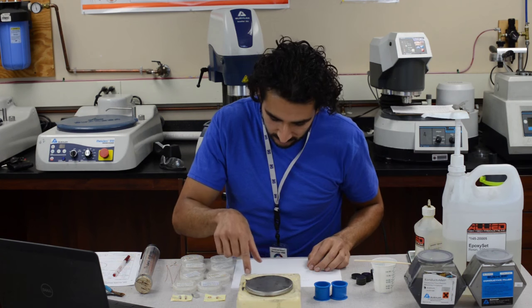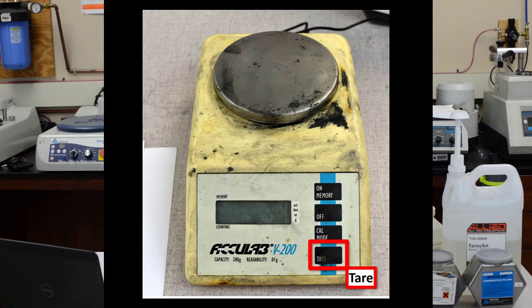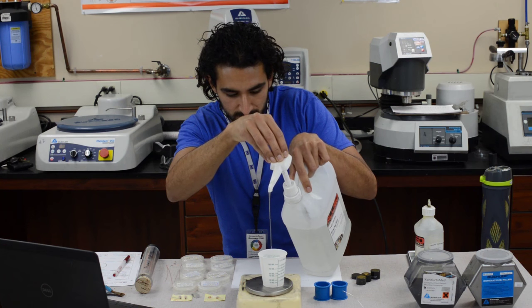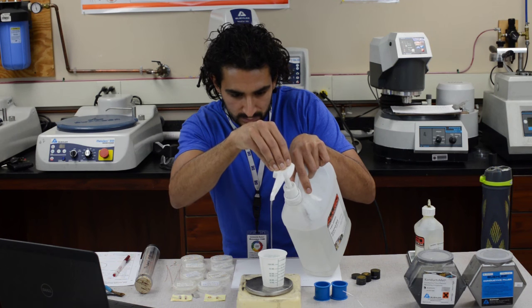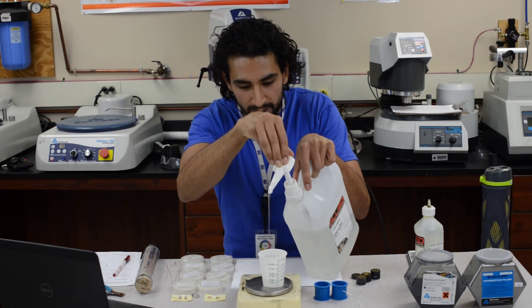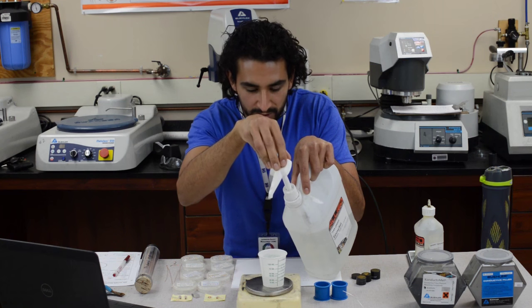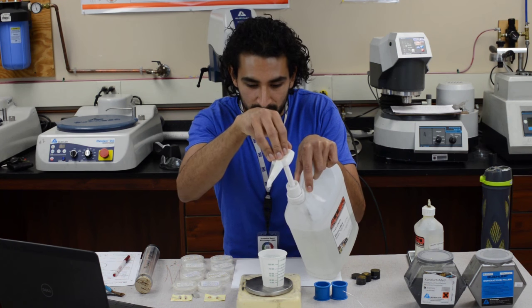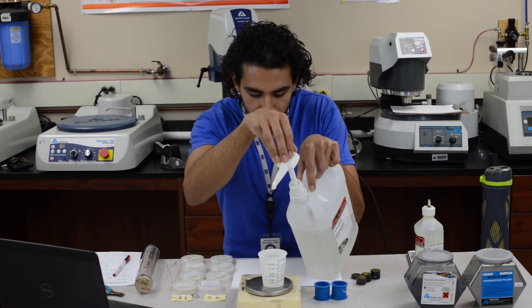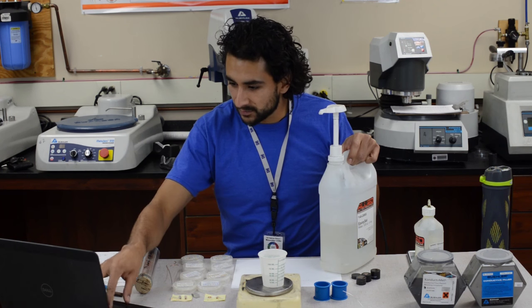Let's mix the epoxy. Let me grab my scale, tare it with my cup on, and I will add the epoxy. Any epoxy you use will have on the back the ratio — the resin to hardener ratio by weight. I'll add a little more — okay, 50.23 grams.